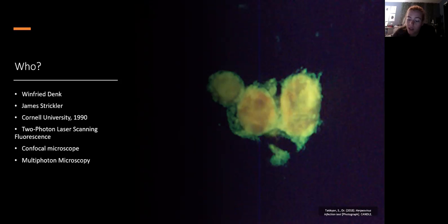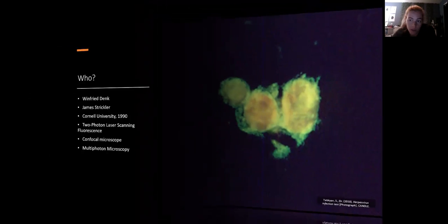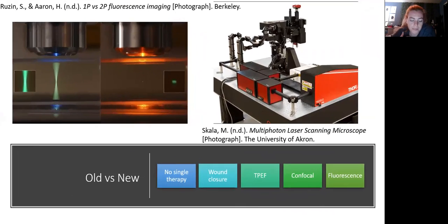Combining these, the photochemistry is spatially resolved, and it showed us the photolytic release of caged effector molecules that were not being noticed before.